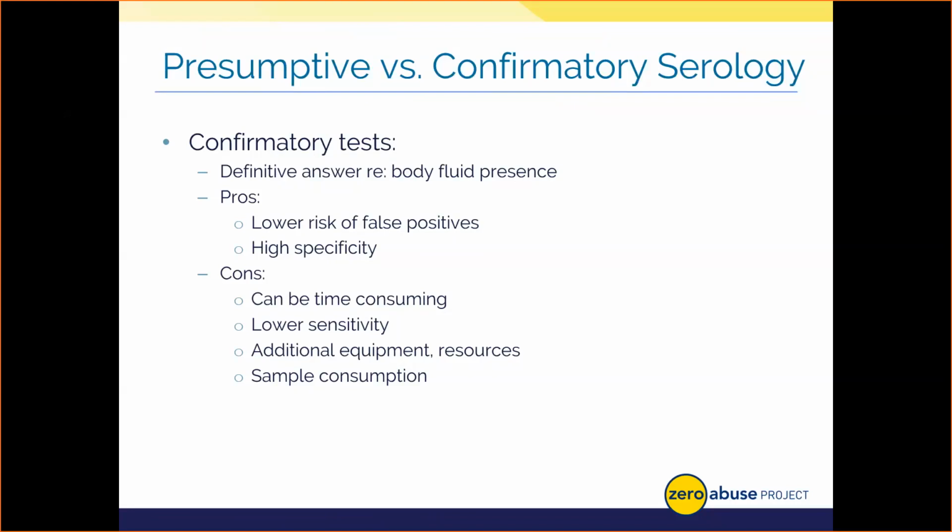The potential concern with these tests is that they can take several minutes to complete and oftentimes require additional equipment or different components. Now, that shouldn't be an issue, but I do know that budget limitations are not foreign to crime labs, so this could be a possible challenge for your laboratory. They also require more sample to consume. As I mentioned earlier with the presumptive test, we're taking more and more sample away. So again, the analyst has to use their discretion to decide if they have enough sample to do this test, or if they even want to do serological testing and just move forward straight to DNA with the item.